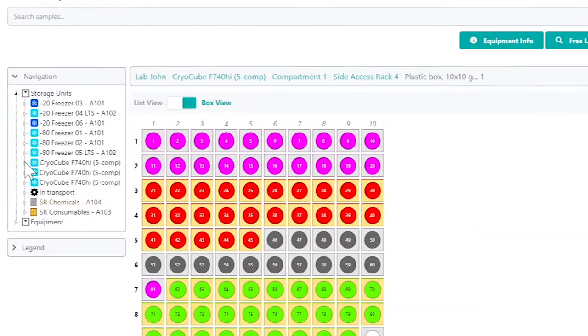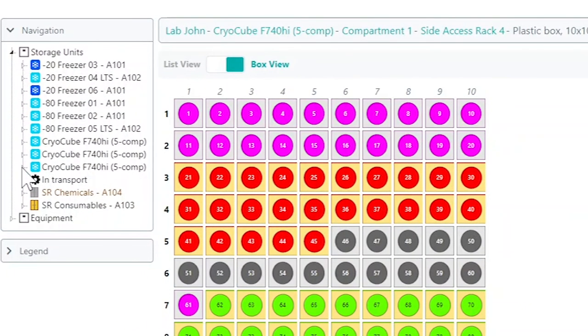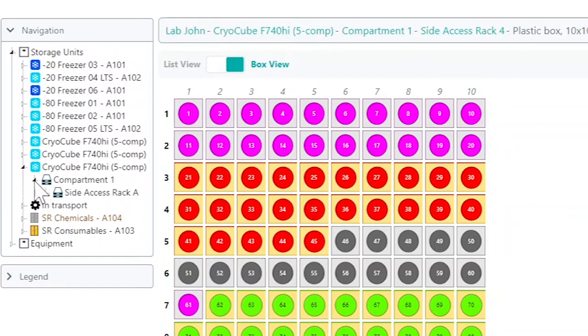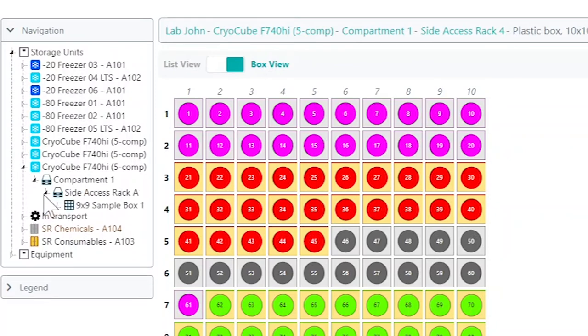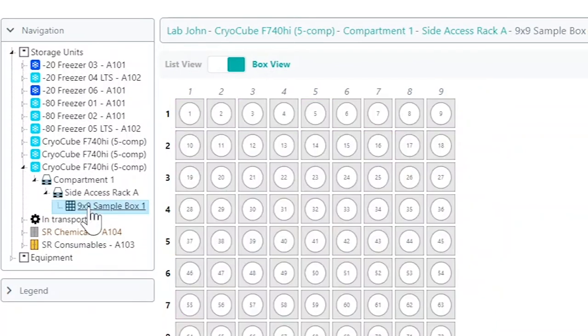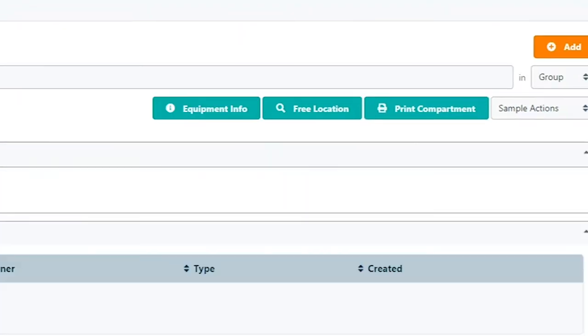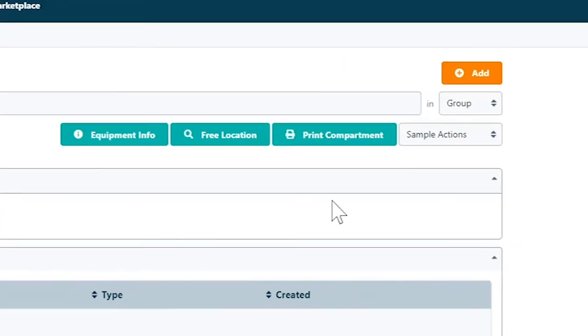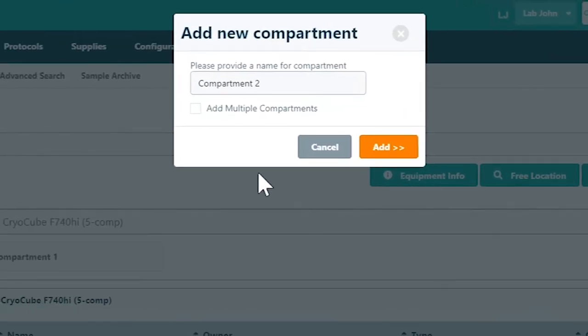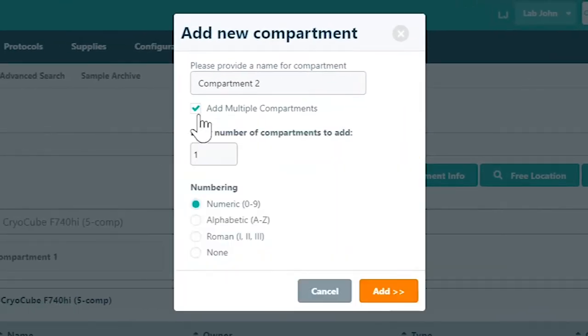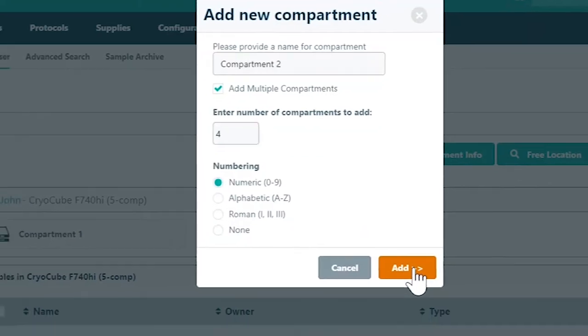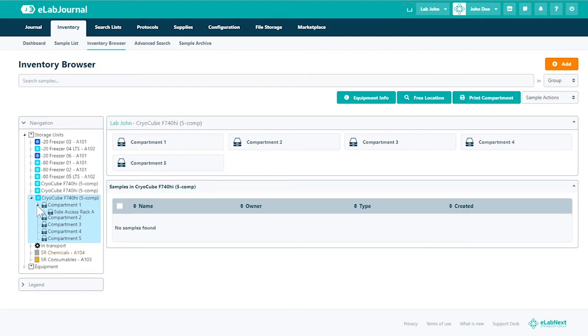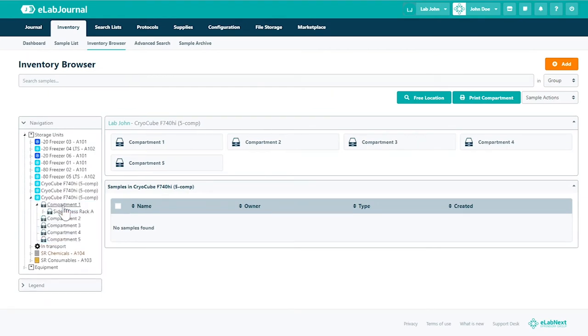Locate and select the newly added storage unit under the navigation. Click the add button followed by add compartment. You can add multiple compartments at once by selecting the corresponding checkbox and entering the number of compartments you want to add.